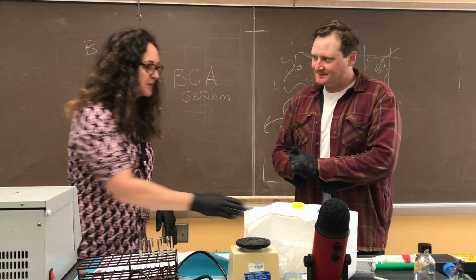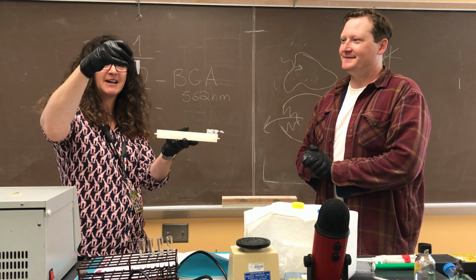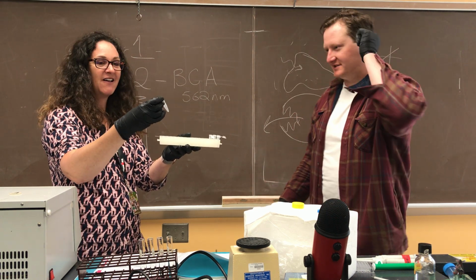Okay, so we've got 4 tubes here. I'm not sure that we've worked with these before, but these take a maximum of 1.5 milliliters, that's milliliters, so 1,500 microliters, just to keep those units in mind.